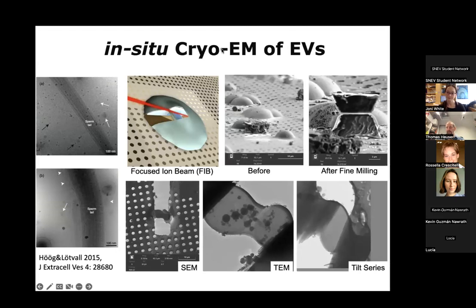This approach is still quite new, and not quite straightforward, let's put it this way. So it will be quite tricky to find the right moment in time. If somebody offers you that as a PhD project, I would be very hesitant, because you might spend many years working on that. But these instruments are now getting better and better. There's just a new type of these cryo-FIBSEM instruments coming to the market, where you can automate this better, where you have an autoloader, you can do high throughput.